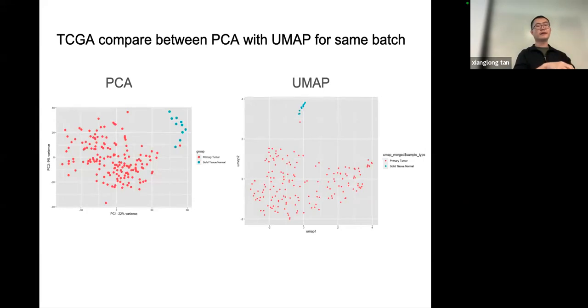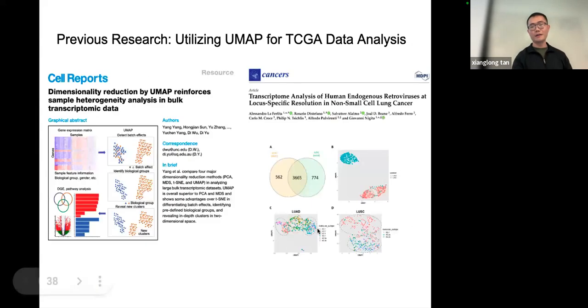This is a good indicator that, okay, different batches of the control sample behave normally. Their transcriptomes are similar between different batches, but different technicians. The cancer samples in lung, adenocarcinoma versus squamous cell carcinoma, clustered separately into two different cancer clusters, just like in this published paper.